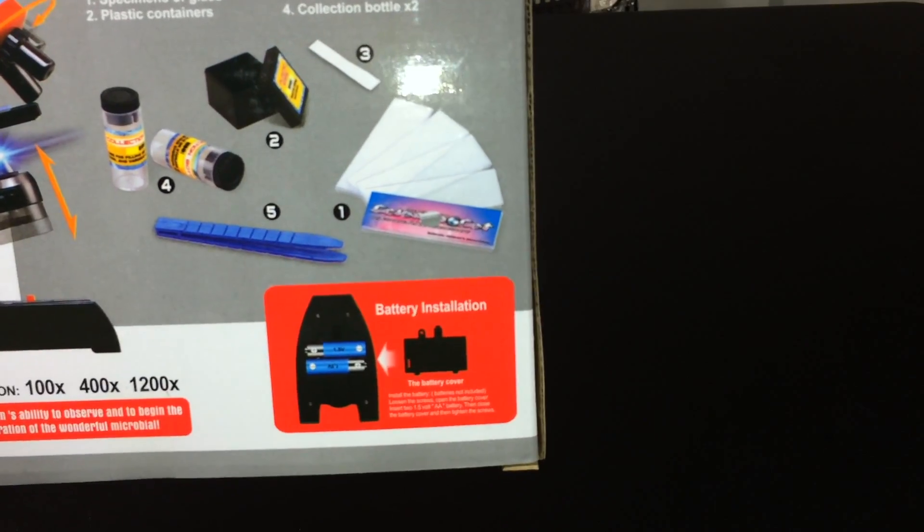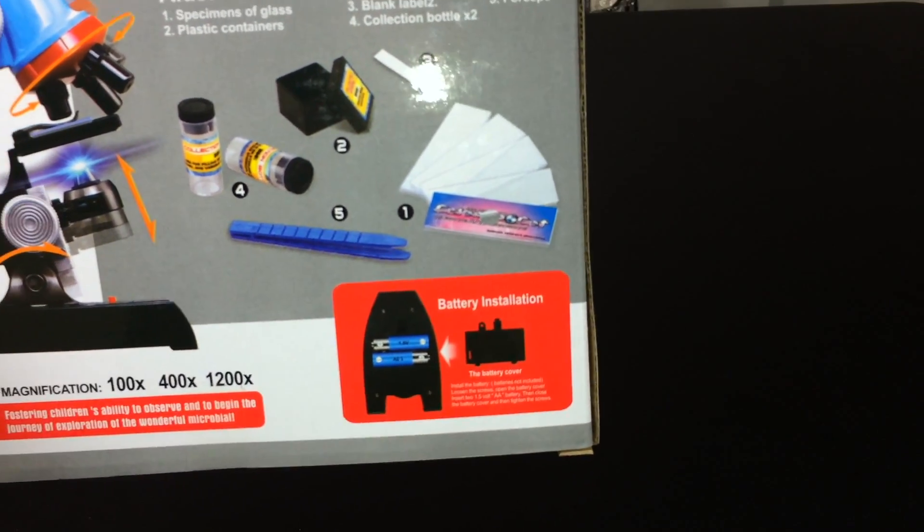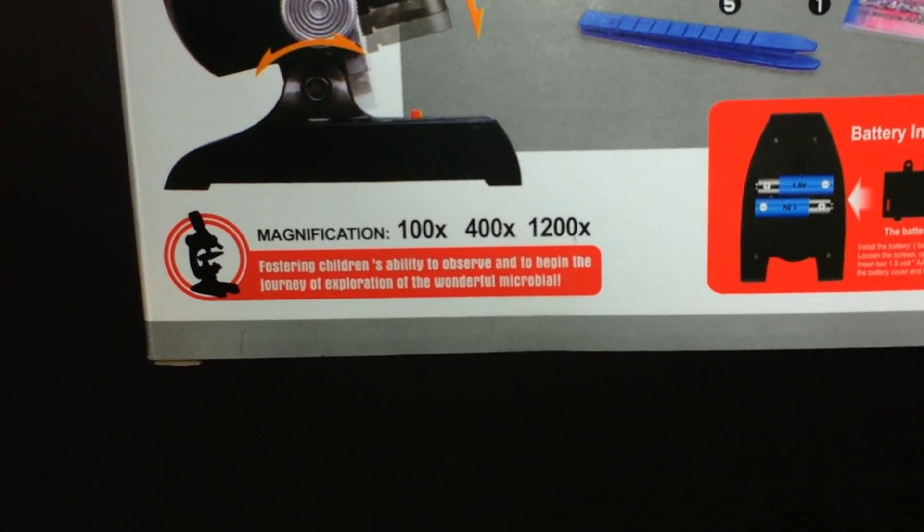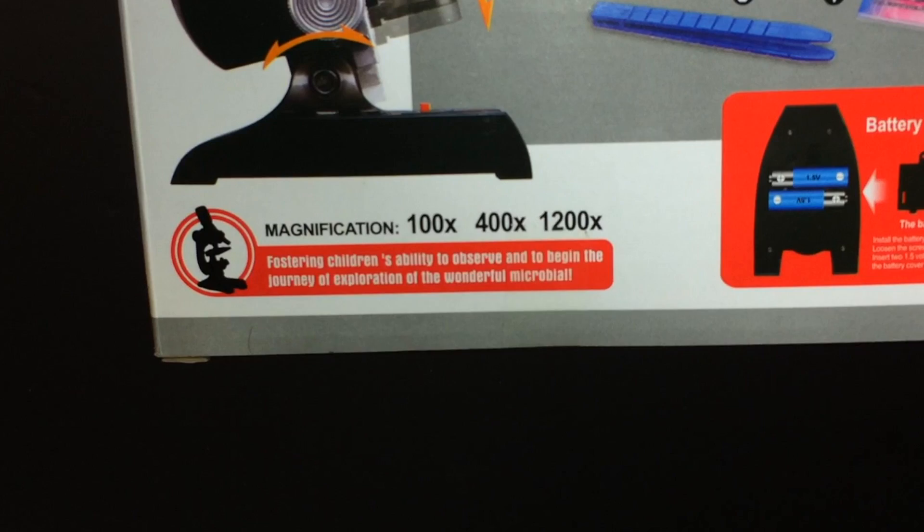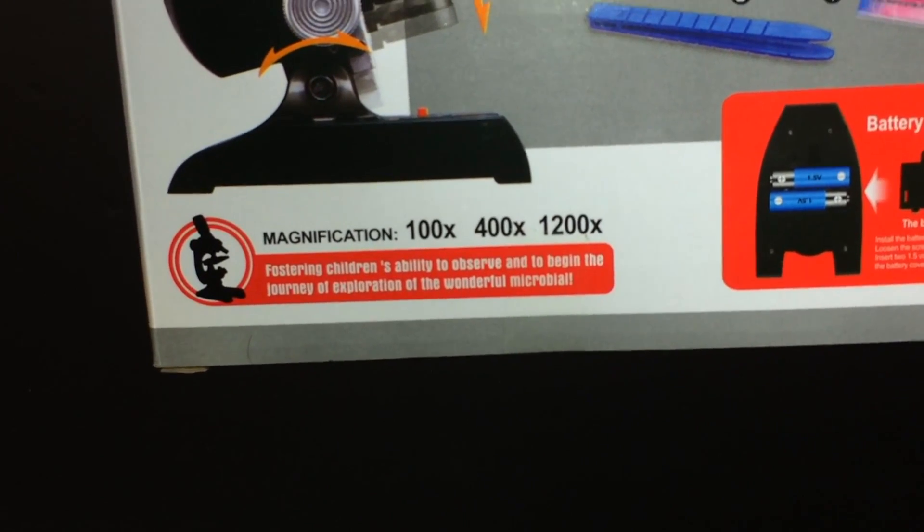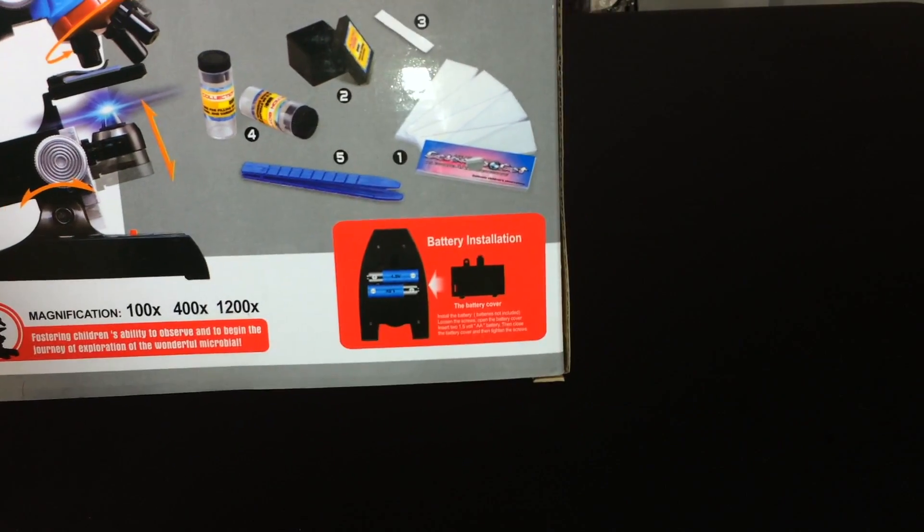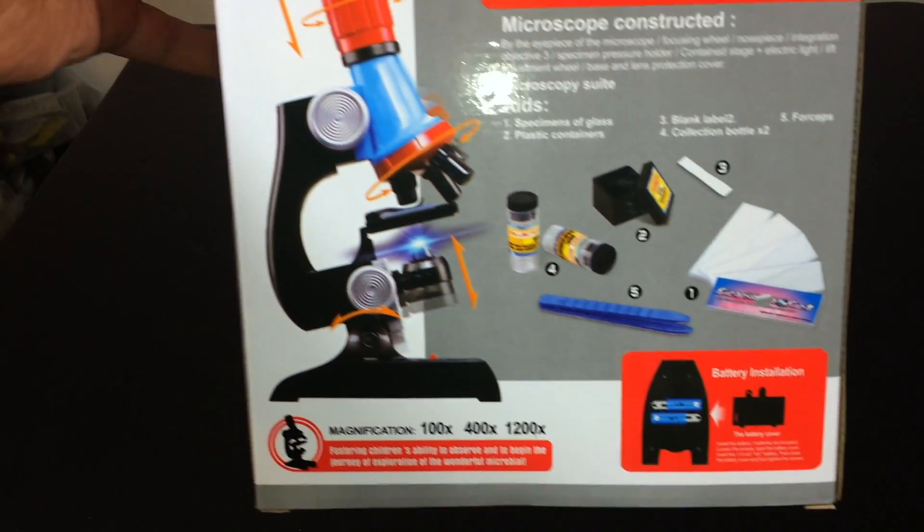It looks like one right here already has something prepared on it. So what we're going to do, we're going to take a look, see if we could actually see anything with the magnification that it claims to have. So it has 100 times, 400 times, and 1,200 times magnification.